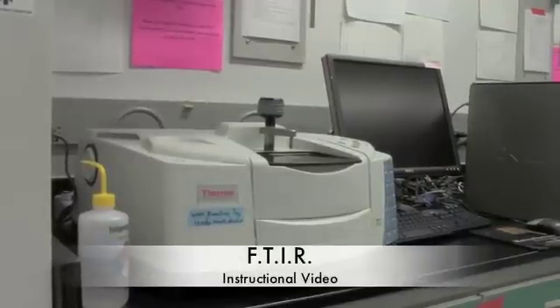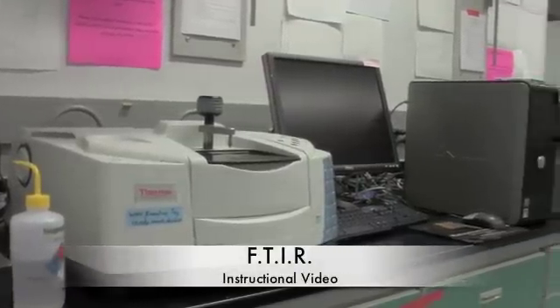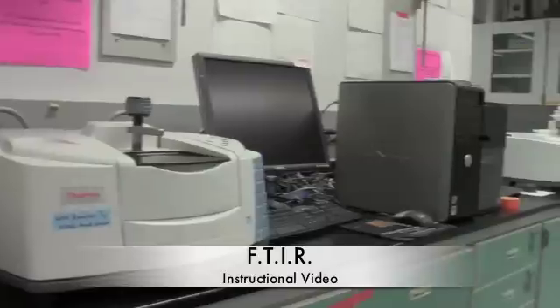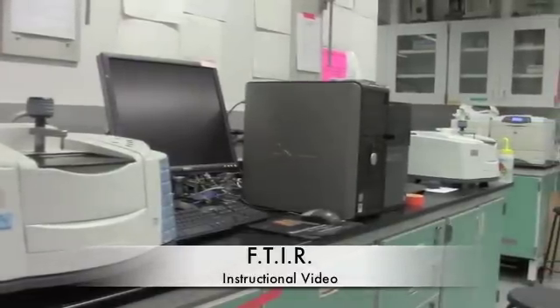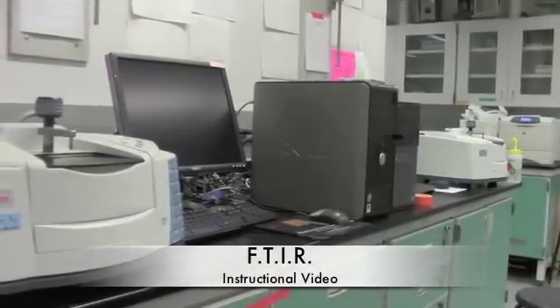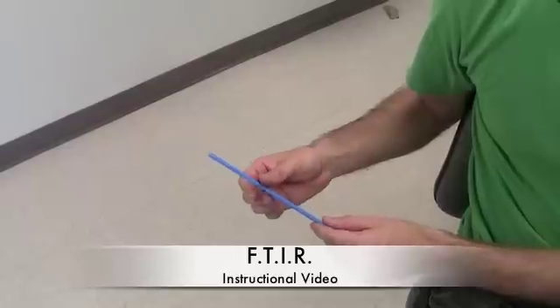Hello. This video is meant to show you how to generate and analyze data from a Fourier transformed infrared spectroscopy machine, otherwise known as an FTIR.